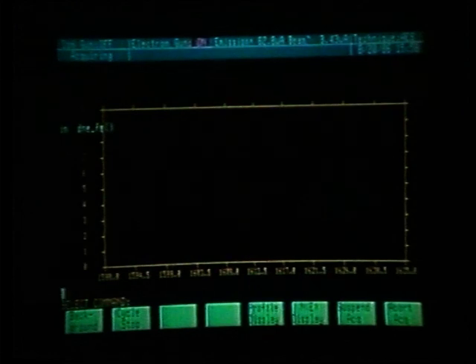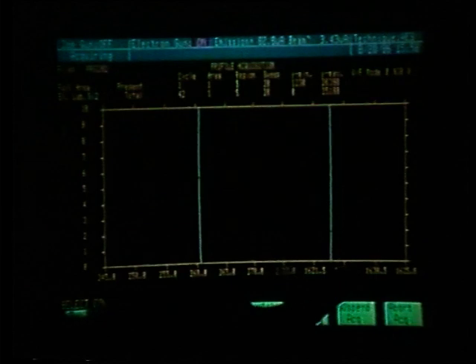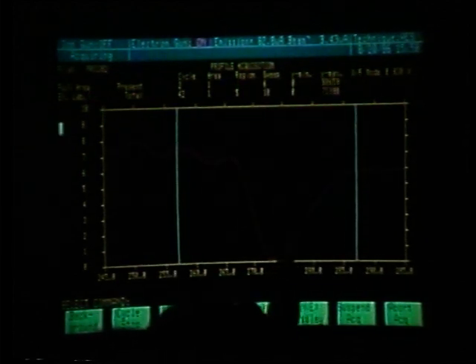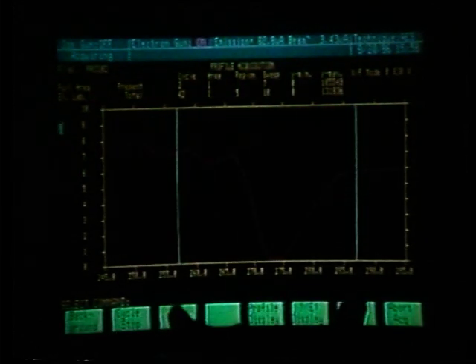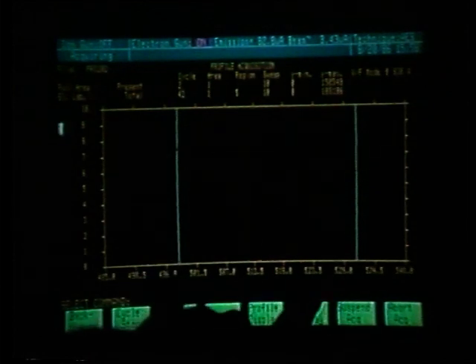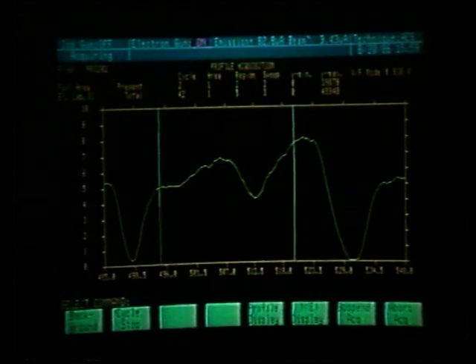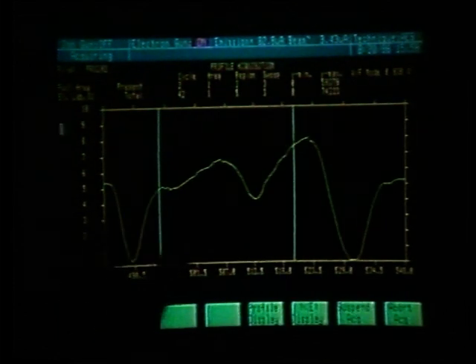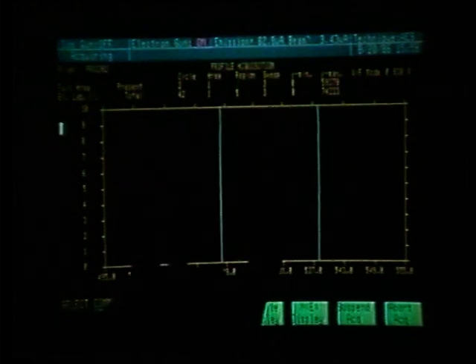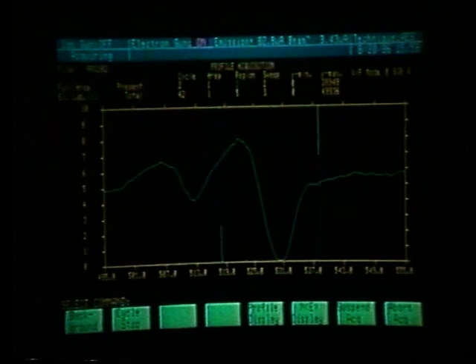We also see now the difference between the acquisition window and the analysis window being indicated by the 2 white bars. When we see our peak-to-peak data, it is taken from the window in between the 2 white bars. At the end of the profile, we can then redefine that region, that analysis window, if need be. We see that with the carbon peak, we will have to redefine.